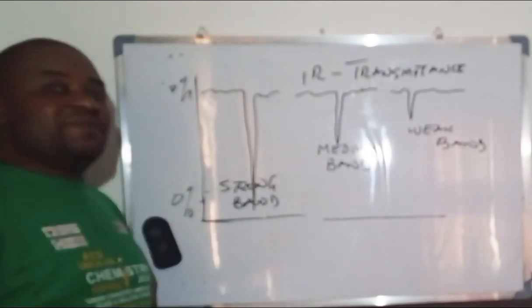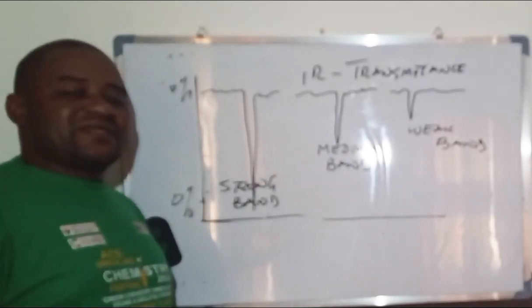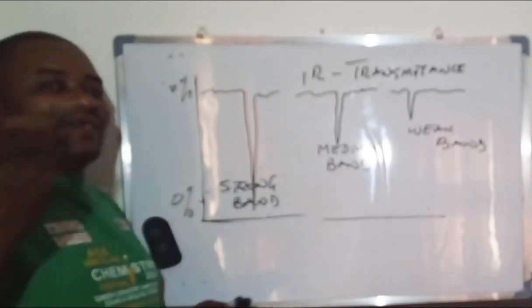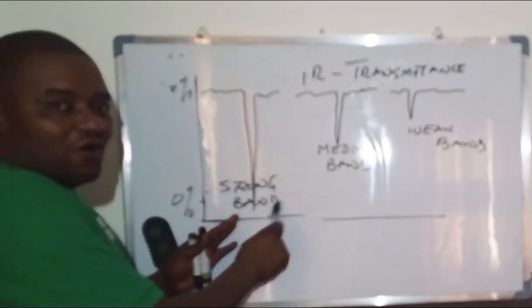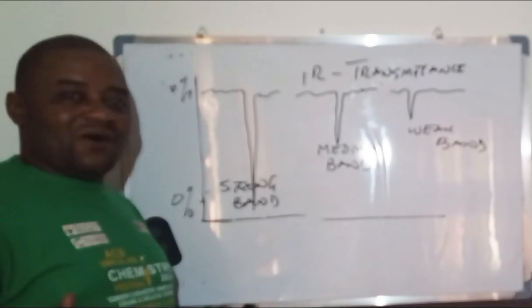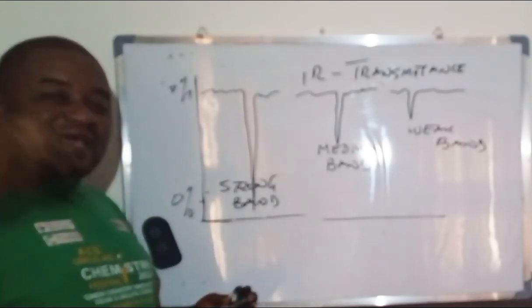But like I had explained earlier, not all molecules with covalent bonds generate spectra or bands. It is only the ones that are polar. So what do we mean by that? It simply means that the intensity of any spectra or any band depends seriously on the strength of that particular bond that is taking part in the IR experiment.